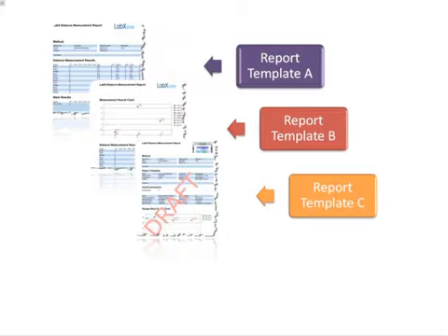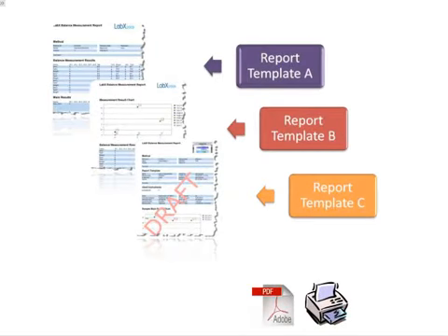Reports can combine several elements, such as charts, graphics, measurements, calculations, as well as specific information on instruments, such as performed adjustments and tests. A user may have several report templates, one for every purpose of use, making it very easy and quick to transform the same stored data into a different style of report. LabX provides extensive options in storing and exporting reports. Some of the available options, for example, are to save reports in PDF format, print on network printers, export to Microsoft Excel, or alternatively save the reports in LabX for later use.